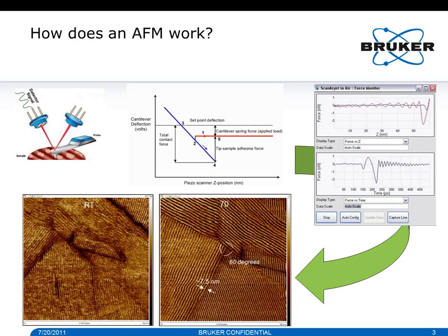It can give you information about adhesion on your sample. It's useful to examine at what working point your feedback will work and so forth. So now what we have done lately is we take this force distance curve and we execute it in extremely fast succession, creating what almost looks like a heartbeat when you go to the doctor's office, as shown on the right side. You could use that pattern basically to scan our surface now.